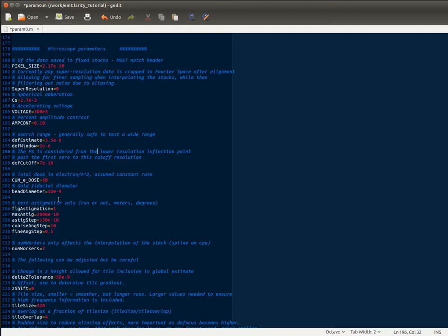The bead diameter, if you have gold fiducials, is going to be specified here. And that's important for erasing those gold beads. So we have 10 nanometers. And then the astigmatism parameters just define the search range for any astigmatism. You could turn it off if you wanted, but this is pretty stable and pretty useful. So I'd recommend you just leave these alone.